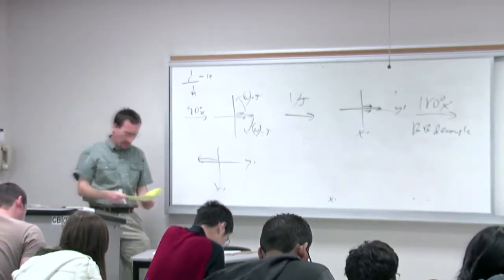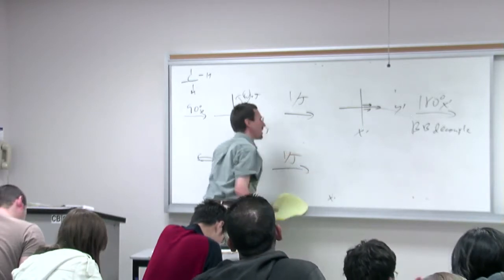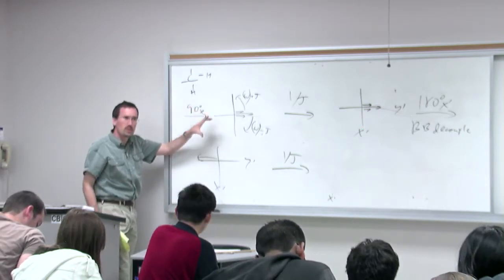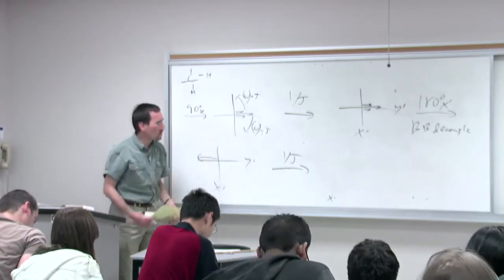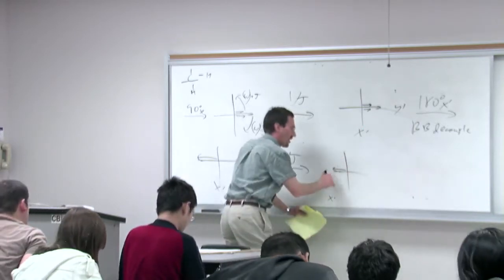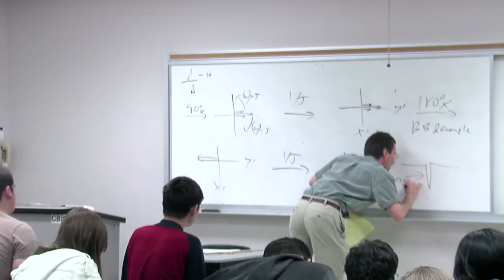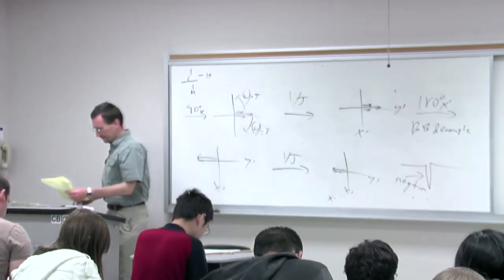And again, you wait 1 over J. And now nothing happens because you've turned on your broadband decoupler, except any refocusing due to the T2 relaxation that's occurred. So after 1 over J, your scenario is still a negative peak, and so you get a negative peak over here.